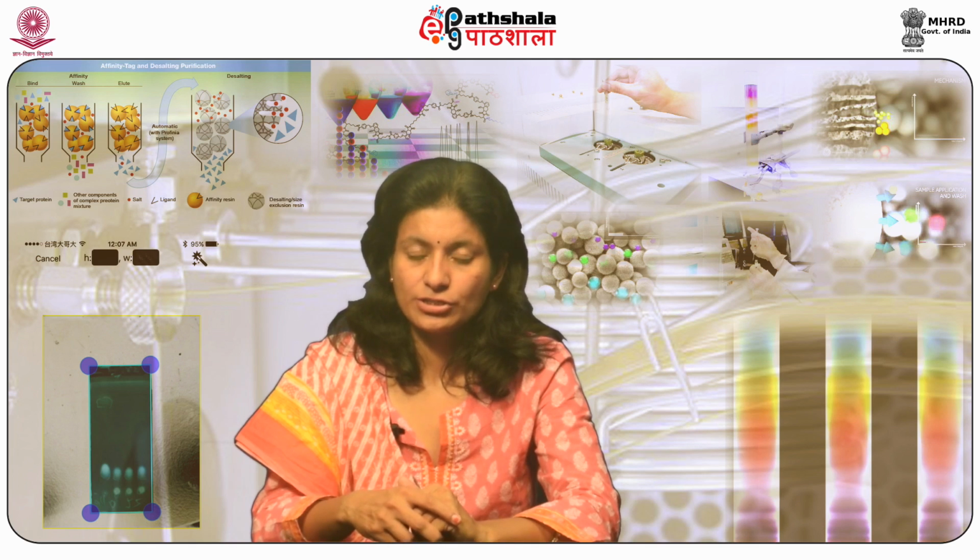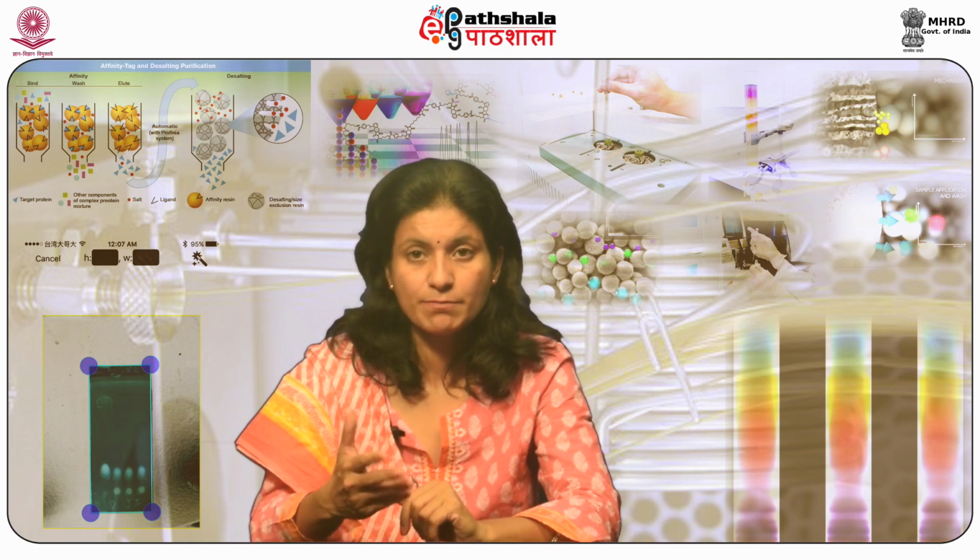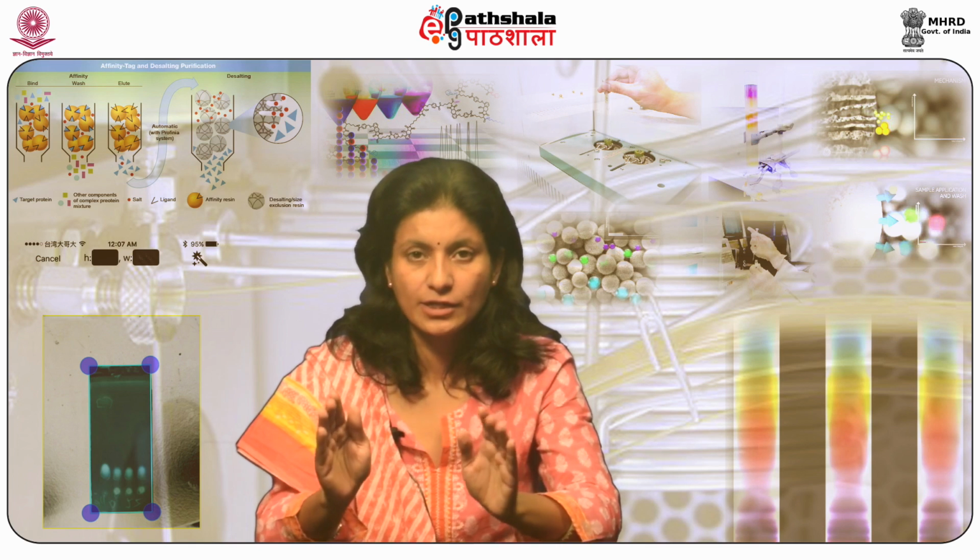In ion exchange chromatography, ionizable molecules are separated on the basis of their total charge.